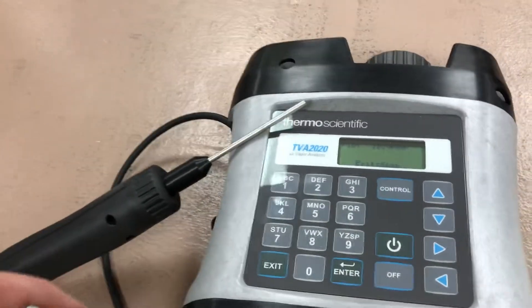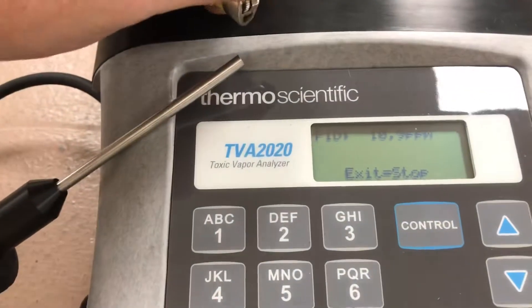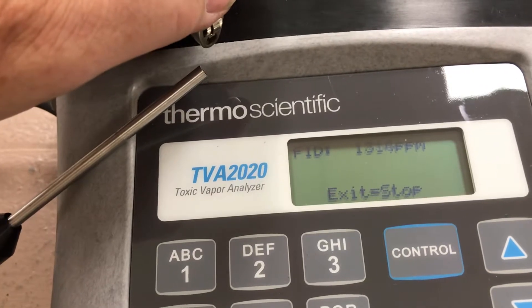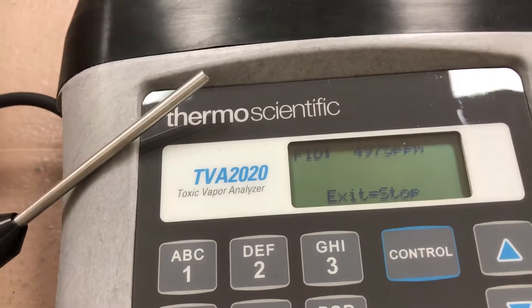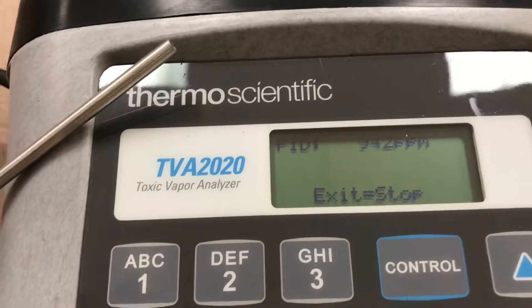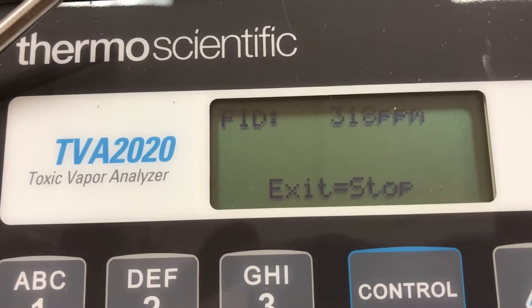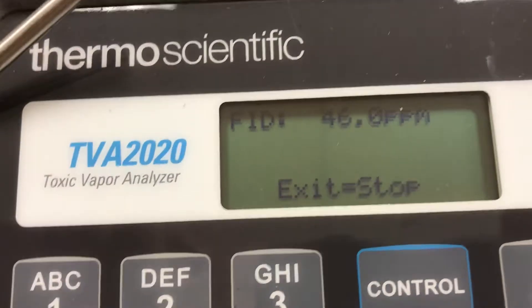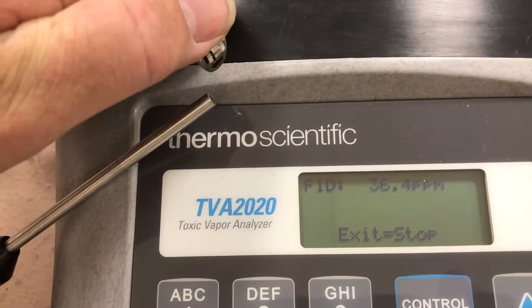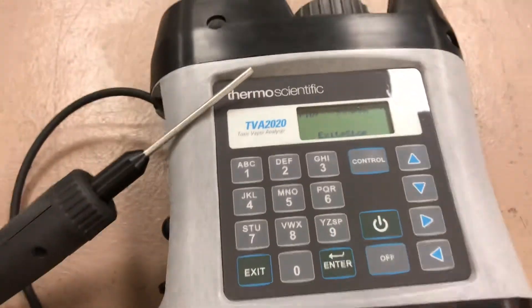You can test it simply by taking a butane lighter — you don't have to light it, just hold it nearby and give it a bit of gas. You can see the reading start to increase: 441, 713, 1300, already at 5000 — it jumped into a percent scale. It has scaling from ppm as well. Back it off and you can see it come back down: 300, 200, 100, 67. Very quick response, great for leak detection and repair programs.